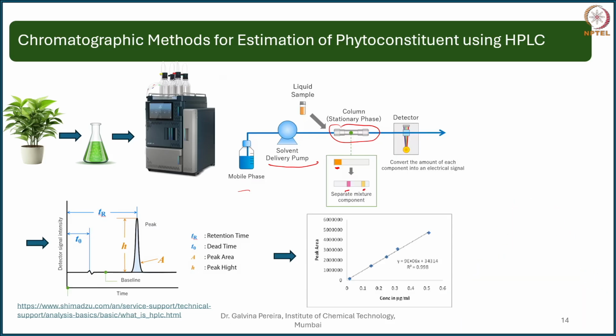So what will happen, say for example, this was your Vasacinone and this was your Vasacin. So you will have two separate compounds coming in. They will travel separately. So first your Vasacin will come out and be detected, and second your Vasacinone will come out and be detected. Now they are detected in the form of a peak. So this peak will have peak height and peak area, that is also like your area under the curve, in a way very similar to your densitometric scan.